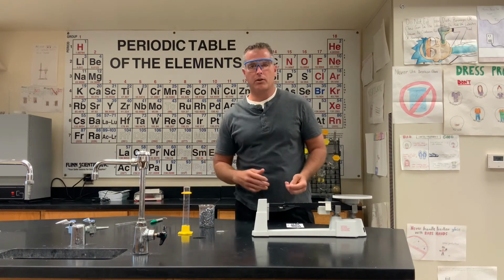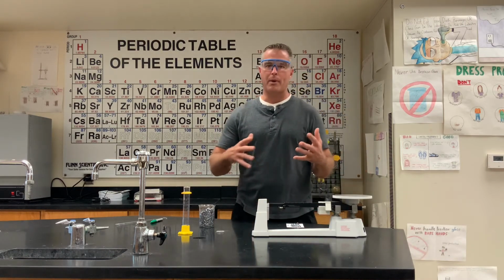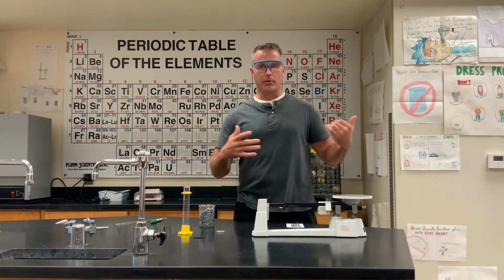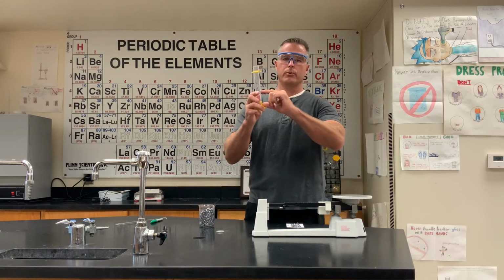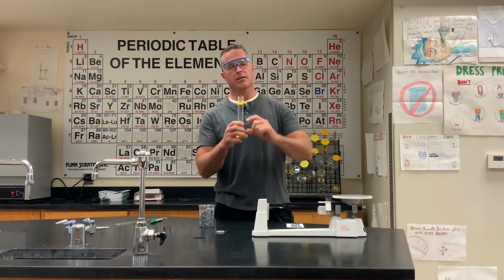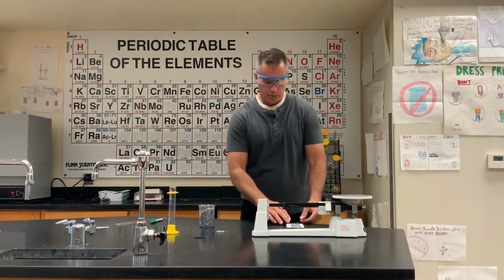So we're going to have to do what's called water displacement. Water displacement is the same thing as if you were in your bathtub, you filled it all the way up to the top and you jumped in, you spilled all the water on the floor and your mom's upset because you spilled all the water on the floor, but that's water displacement. So we're going to get a known volume in the graduated cylinder, we're going to dump the rocks in, and it's going to change. And how much of a change is the volume of the rocks?